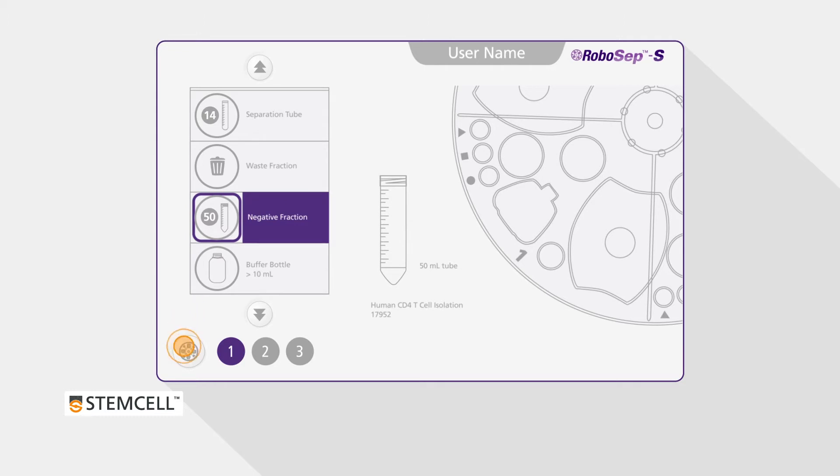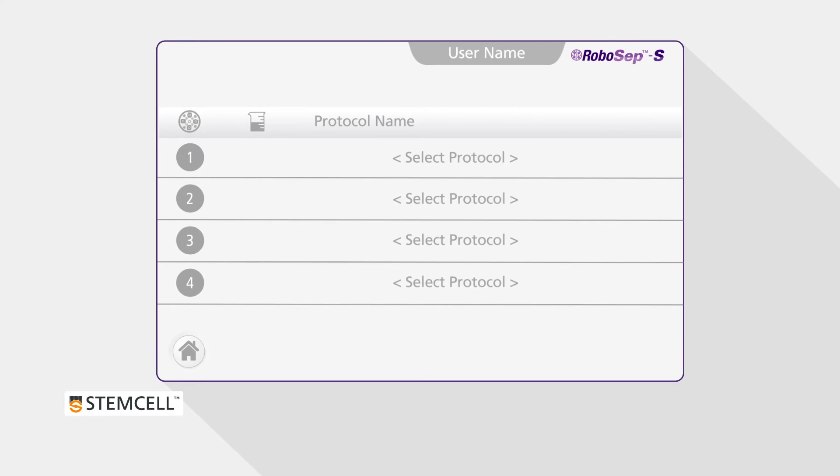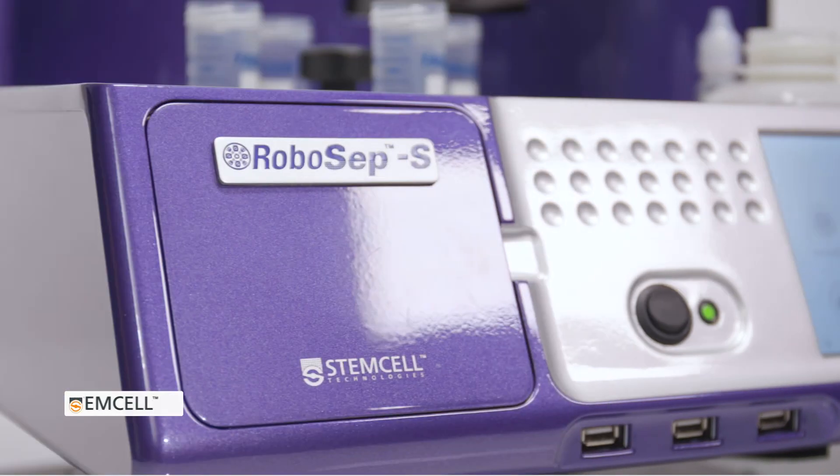After unloading, press the Carousel icon to return back to the Run Samples screen. Now the instrument is ready for another isolation.